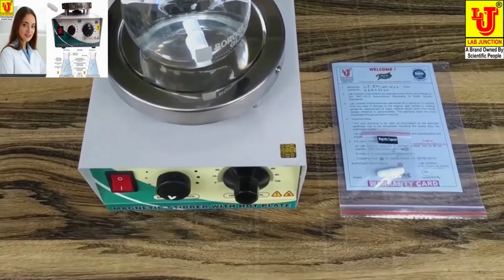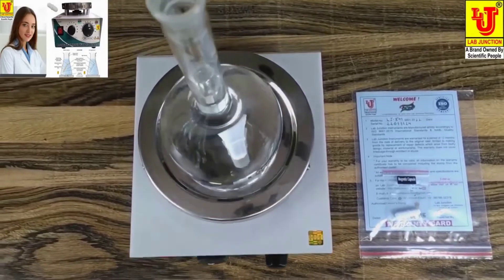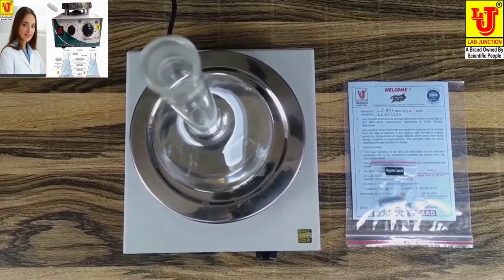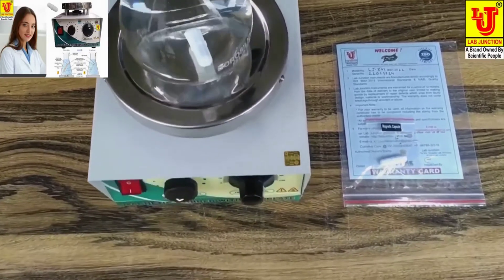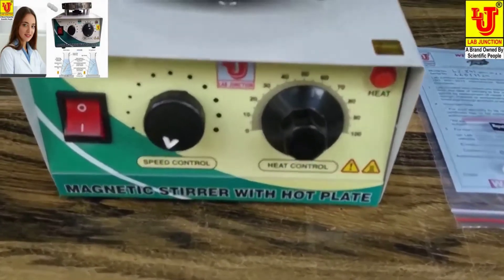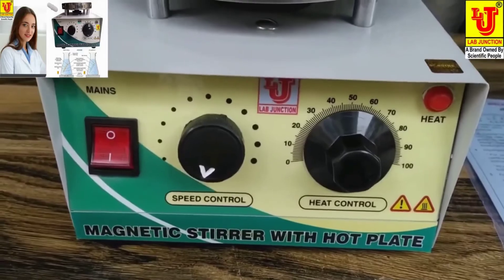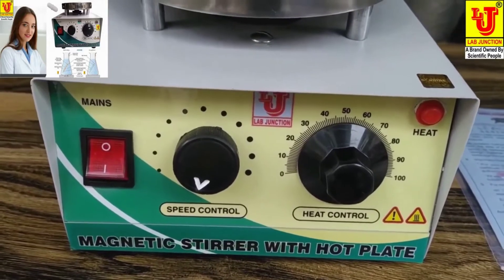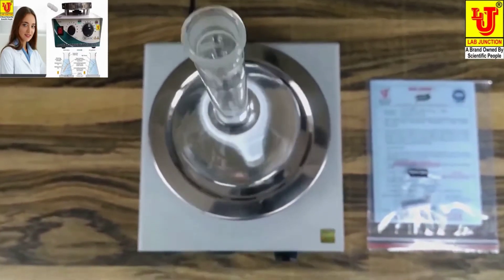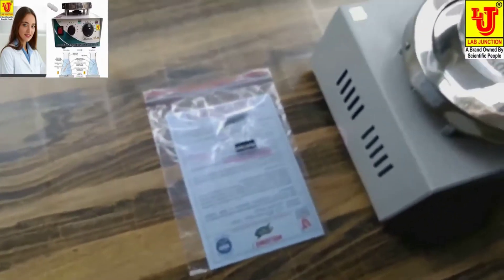Lab Junction Magnetic Stirrer with Speed Controller and Hot Plate LJ841 as per quality standards.